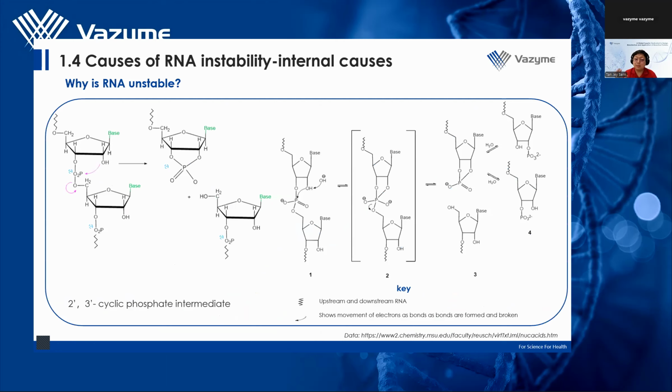So what causes RNA degradation, as you might ask? We can analyze this from both internal and external factors. First, with regard to internal factors, RNA itself is inherently fragile in nature as it is made up of long chains connected by 3', 5' phosphodiester bonds.